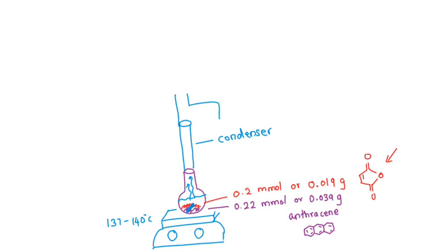At the same time, we don't want the moisture to enter the flask. So what we do is we put some drying agent, right? What's a drying agent? It just absorbs moisture. When you buy new electronics or new shoes, you'll see a packet of silica inside your package, right?